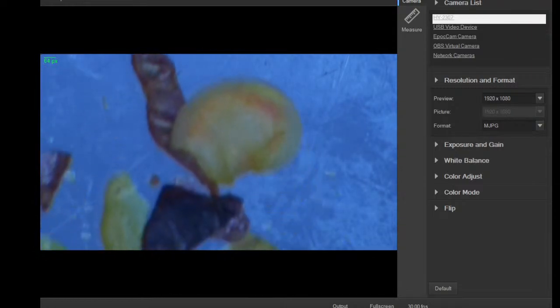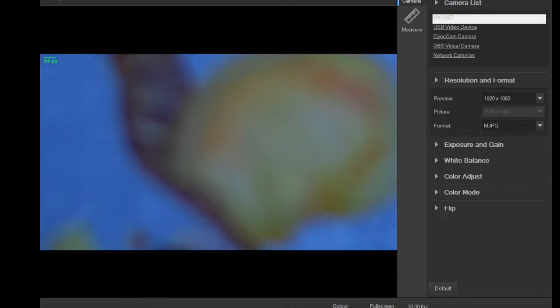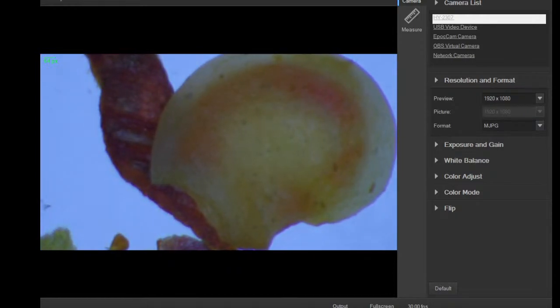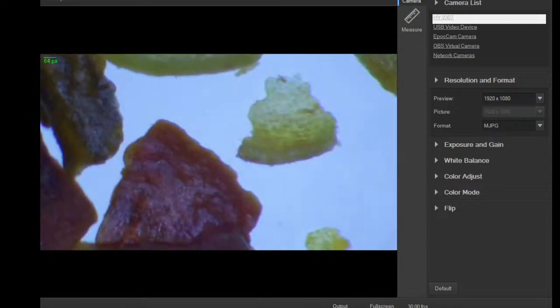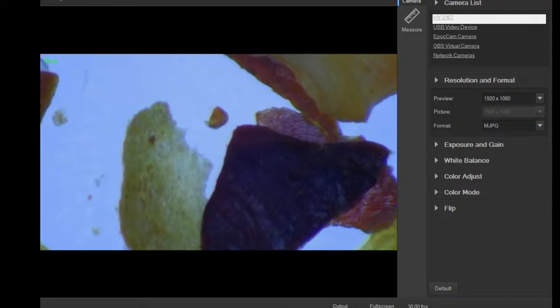get a better close up of this seed here. Turn the light up so you can see it better. Oh, that was actually on max. Turn this extra light on here. See if they backlight. Eh, not so much. They're pretty dense. Very dense little seeds. Some of this part might be transparent. Yeah, they're all pretty opaque. You're gonna see the colors though. Oranges and reds and yellows and stuff. It's kind of nice.